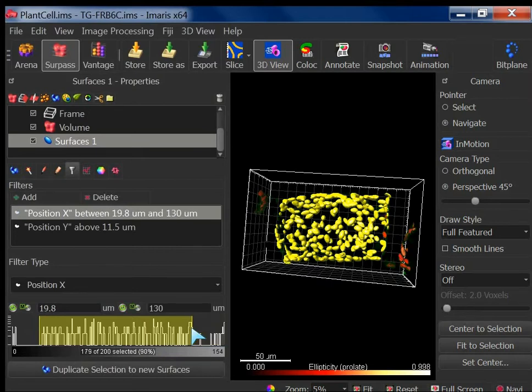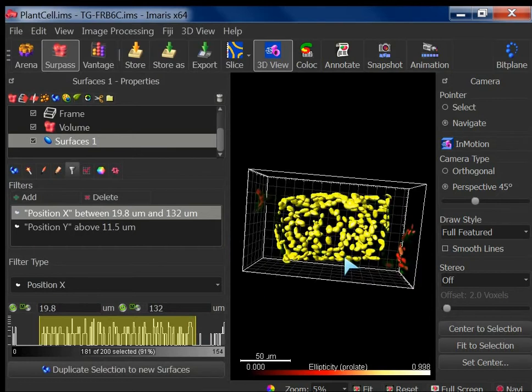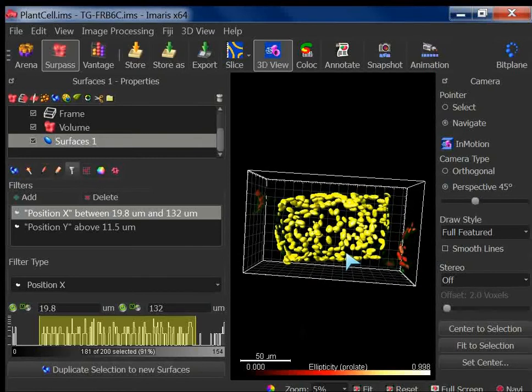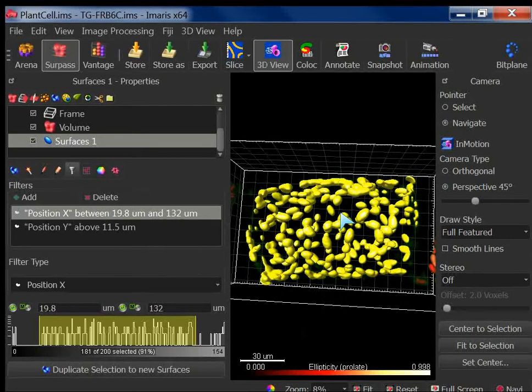So important. So here I have created the region of interest in the centroid based on only X and Y. Y doesn't make sense because there is no outlier in the Y direction as such. See here. So now I can go and say duplicate selection.